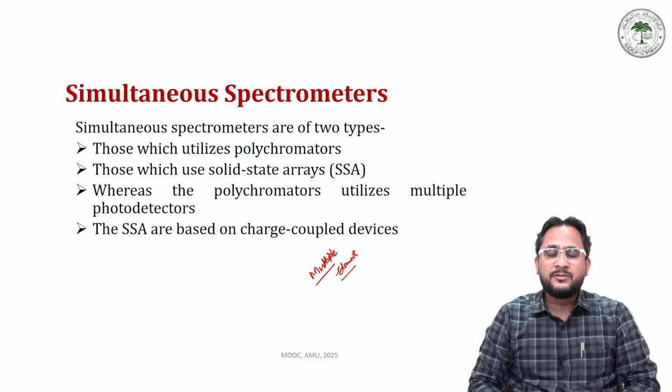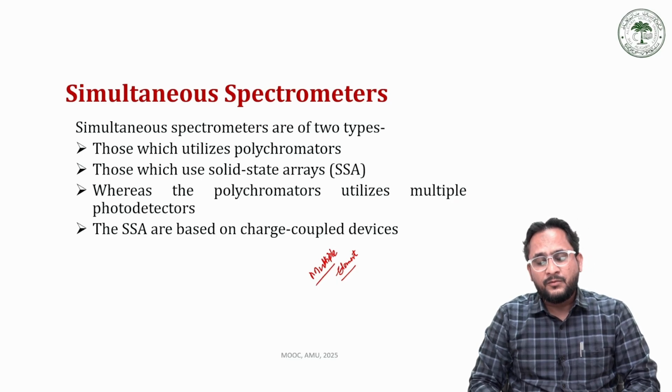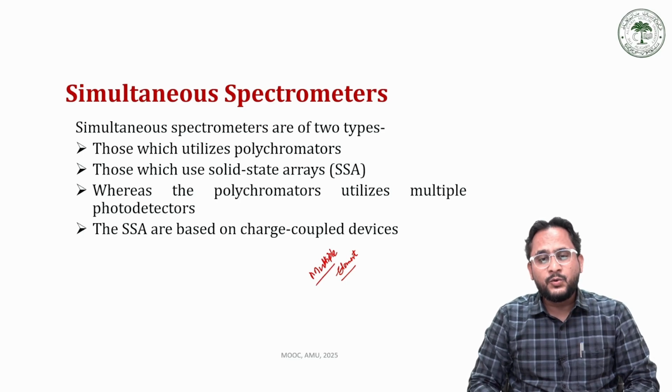Further, in case of drinks like juices or soft drinks, in order to identify the possibility of different elements, we may use these simultaneous spectrometers.